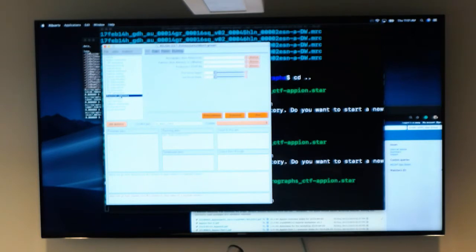Okay. So this is a really brief introduction to the Relion interface, and the main thing is that given how long this is taking, this takes 10 minutes to extract, you may opt to even bin more aggressively. Or not. Or you may decide to shorten your star file and just say, I'm only going to use the first 10,000 particles or whatnot. I think yours might be slow. I think mine's slow. You might be done already, right? I might have a slow instance. So this is a good point. Normally it would finish in 2-3 minutes. Maybe your instances are a little bit faster, so you should probably most likely extract it in a couple minutes.